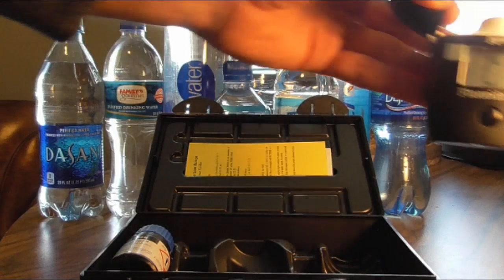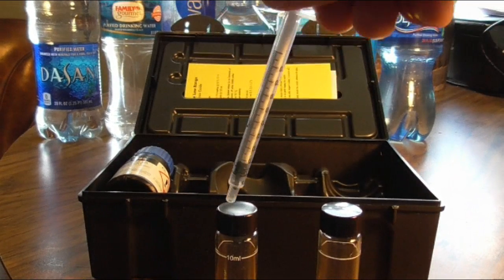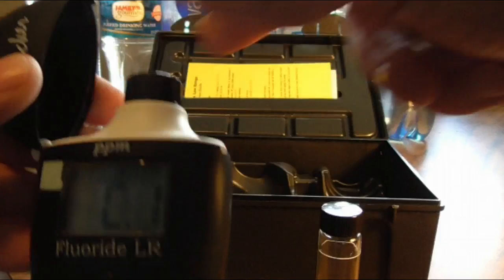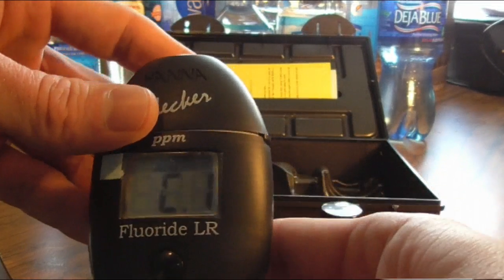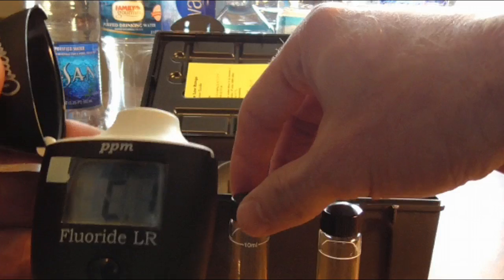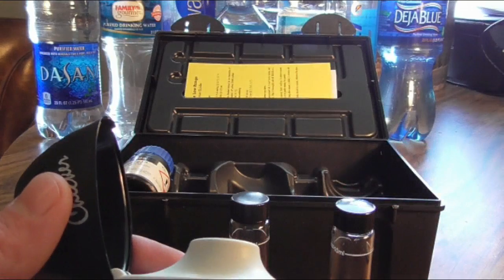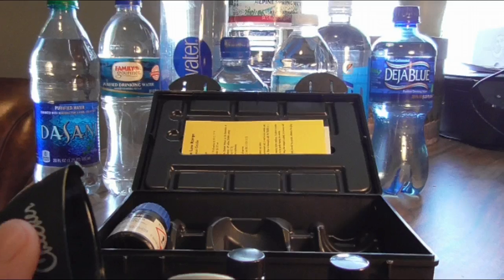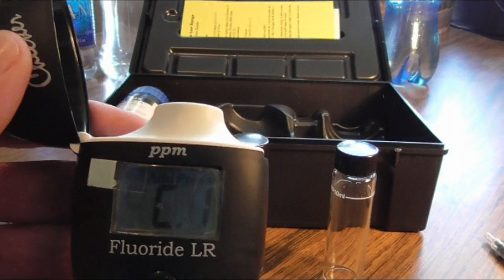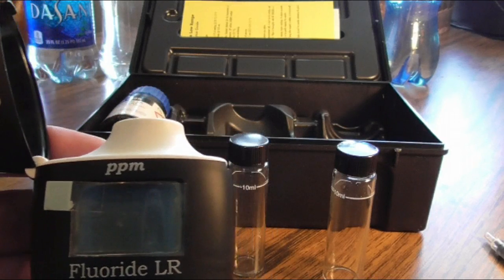How this works is basically you take your two vials, take your reagent, and put two milliliters in each one. You put your distilled water in this one, pop that into this, close it, and hit this button and it will do a timer that counts down for two minutes. When it's done it will say C2. You then take the two milliliters and add eight milliliters up to the line of your sample water — each individual water — then hit the button and it does the reading and tells you the parts per million of fluoride in your water.